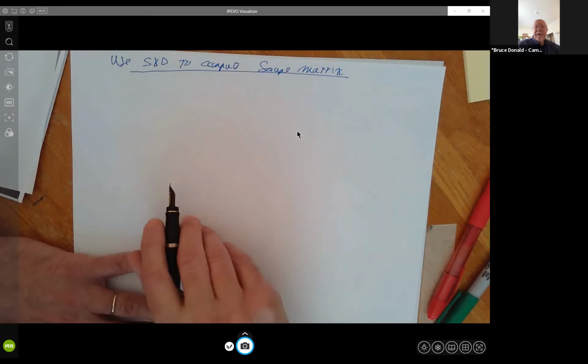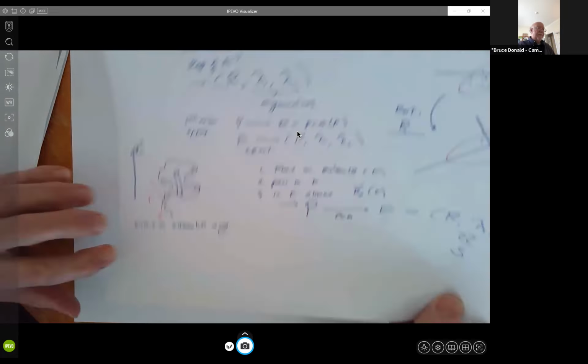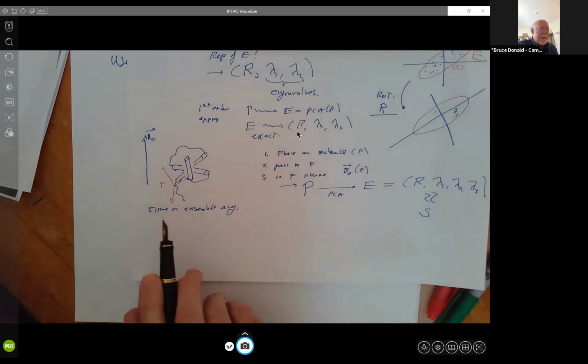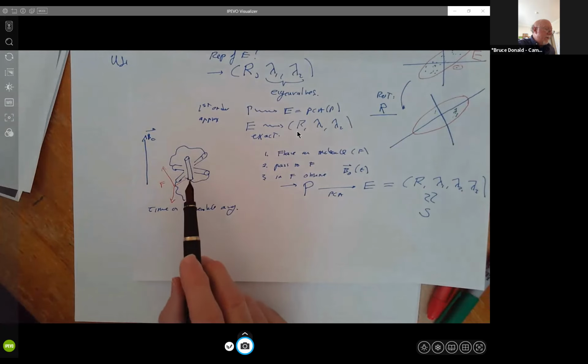So suppose we have a protein. Again, my protein's going to look a bit like this, right? And basically from modeling or from experiments, I can look at CD, or I can look at just the chemical shifts, or I can look at predictions. I know it has some helices in it, at least one helix, and I know roughly where the helix is. Or if you like to stay with the NMR world, I could just look at the phi bond angle from the J3HNHA experiment, see that it's the alpha helical region. That plus the chemical shift should tell me where the helices are.